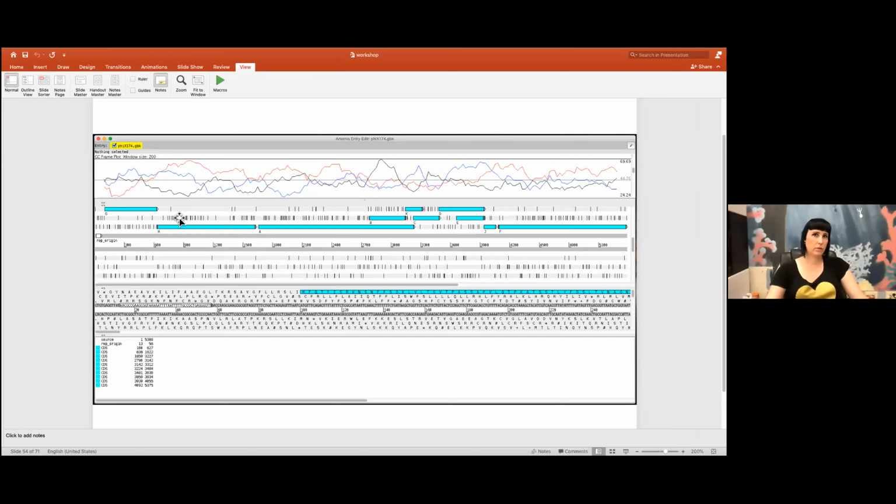Yeah. Okay. So this is what Artemis looks like once you load it. This one already has the genes annotated because it's just a placeholder that I put the final genome in. I didn't plan on having the genes. In this top screen, you can see the GC frame plot that I mentioned. In the bottom, you can see where the genes are, and you can see that the genes occur in these long open reading frames, and they really match the GC frame plot.